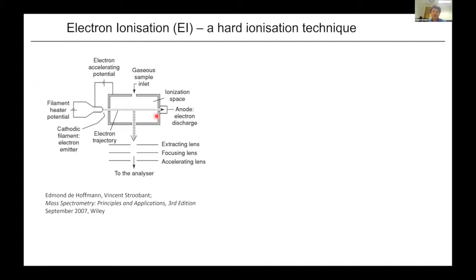In A levels, whenever mass spectrometry is mentioned, quite typically it's always electron ionization, and that's probably largely for historical reasons. It's a method that has been around for a long time, and therefore still features in the school curriculum very heavily. It's still relevant today, mainly in the context of GC-MS instruments, combining gas chromatography separation with mass spectrometry analysis.